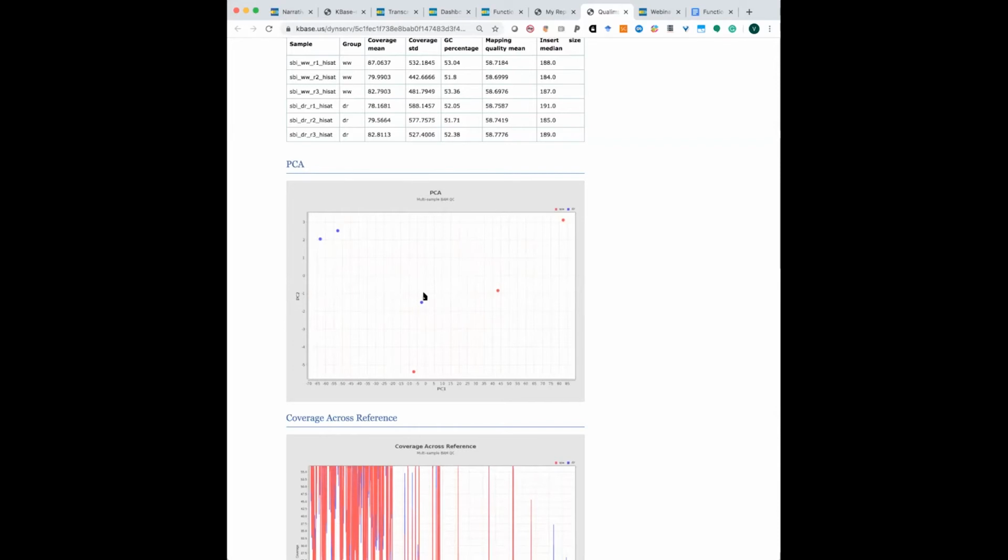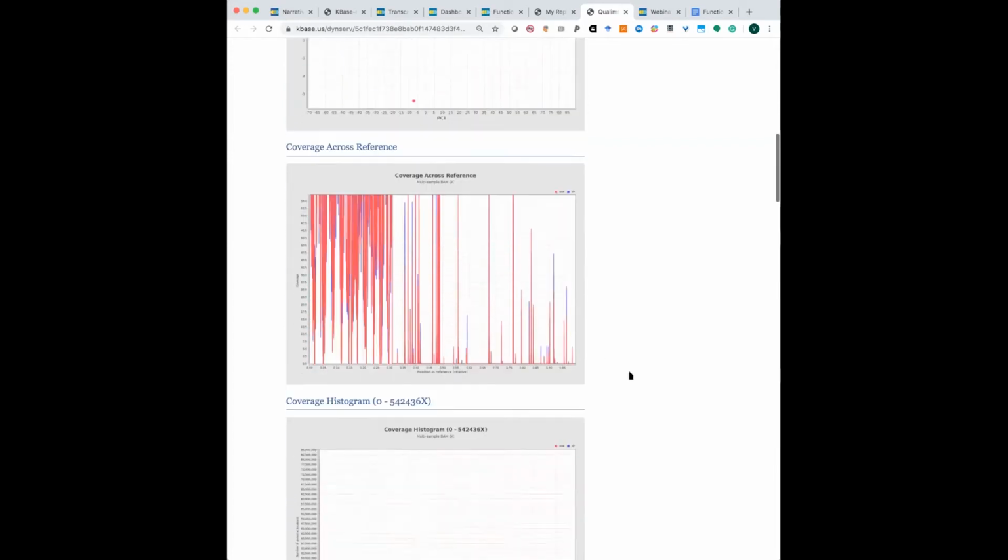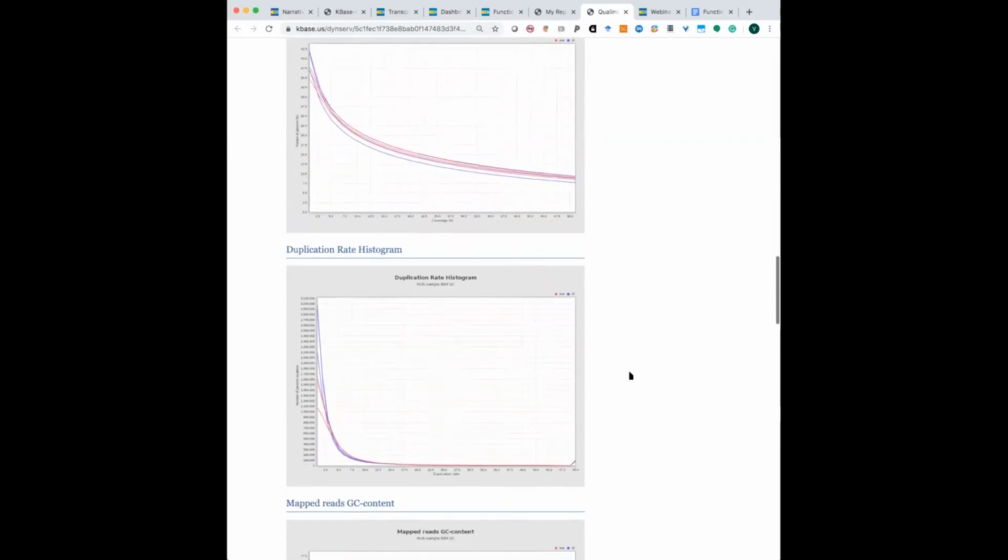Again, depending on the impact the treatment had on those number of genes, you may see them closely clustered if it had a really huge impact, or maybe not. Right? So it gives you some idea of where those samples stand with respect to each other. Okay, and I'll show you a few interesting plots.